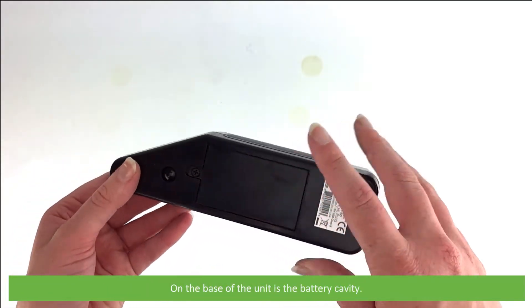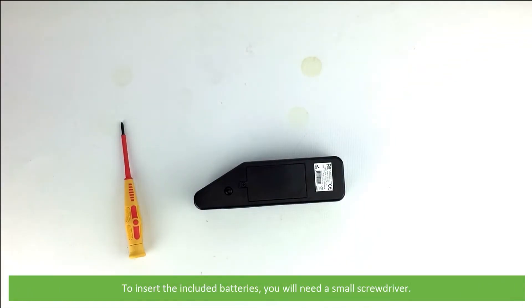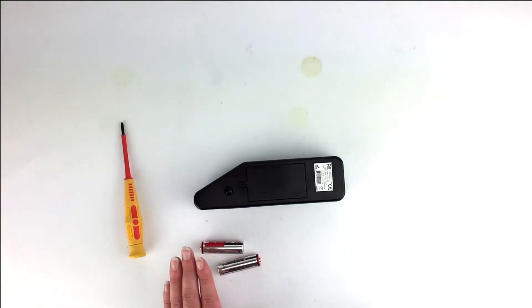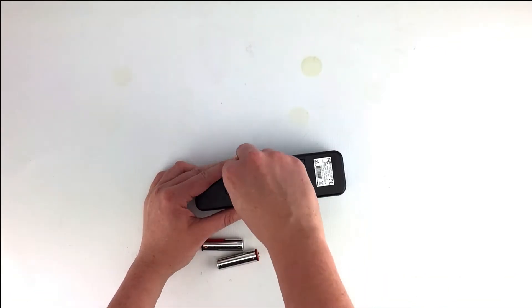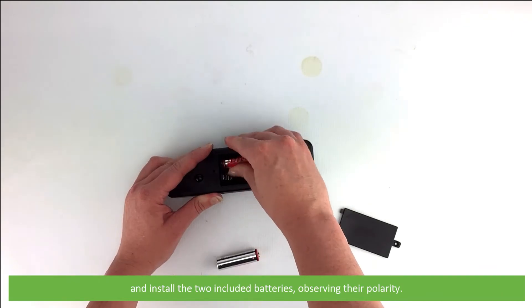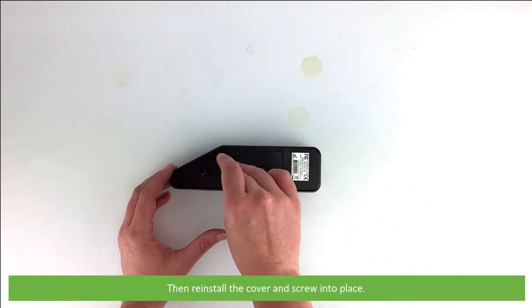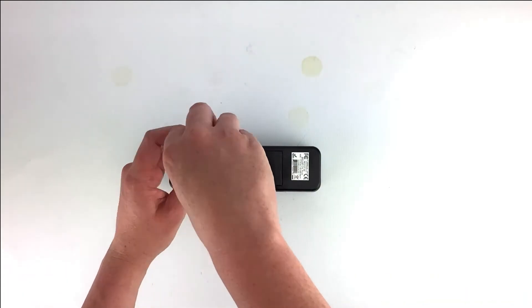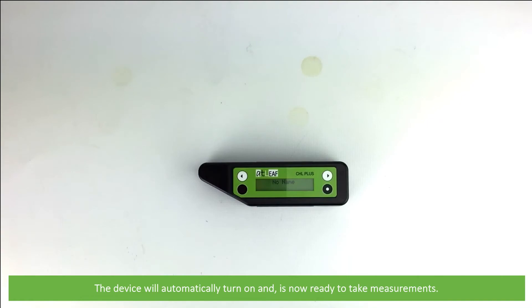On the base of the unit is the battery cavity. To insert the included batteries you'll need a small screwdriver. Unscrew and remove the battery compartment cover and install the two included batteries, observing their polarity. Then reinstall the cover and screw into place.